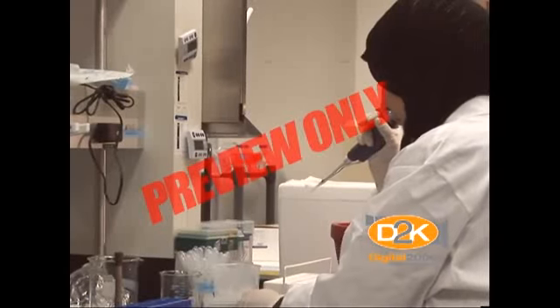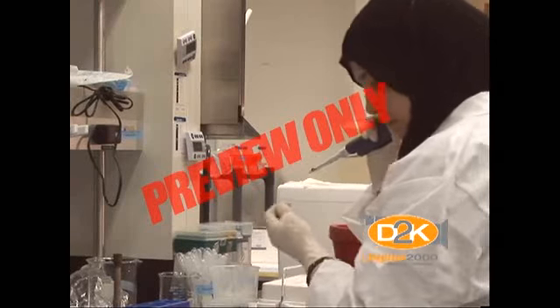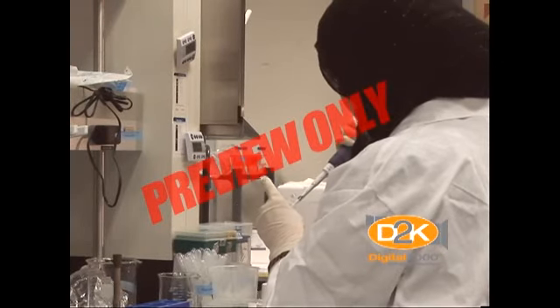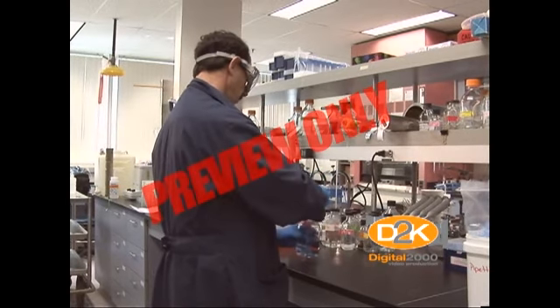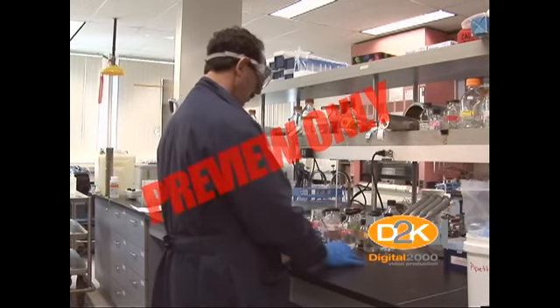Level 1 precautions rely on standard microbial practices without special primary or secondary barriers. Biosafety Level 1 criteria are suitable for undergraduate and secondary education laboratories.